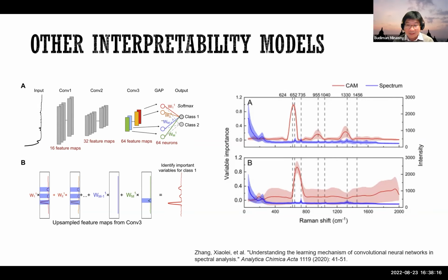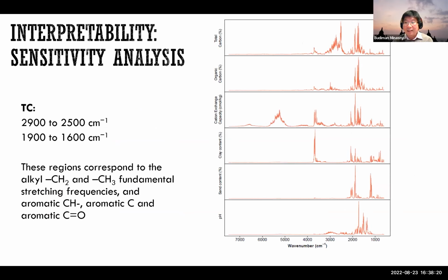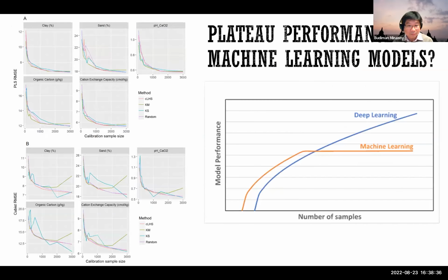It'll be interesting to see how this compares. The only thing this method does is vary a particular wavelength. It doesn't take into account the correlation with the others, while in the prediction there may be multiple correlations that are not explained by this.